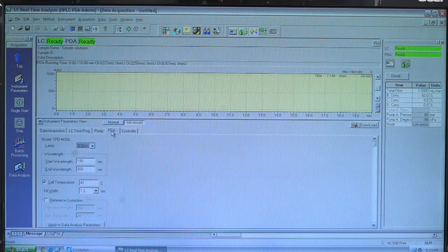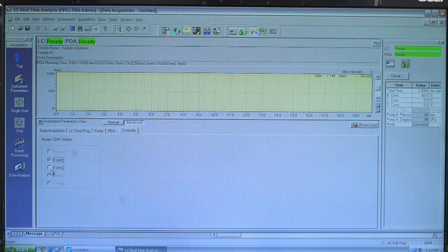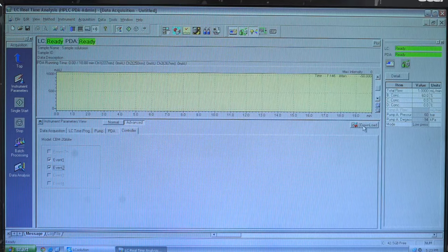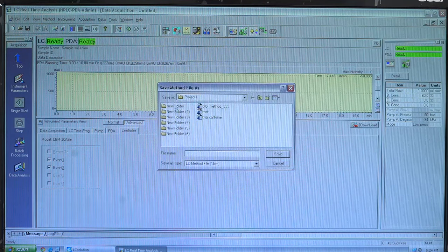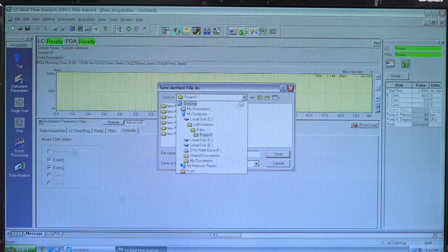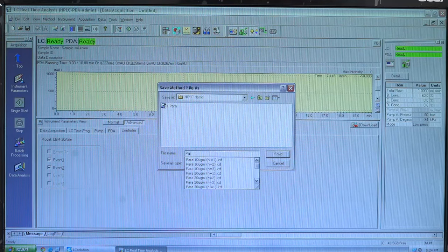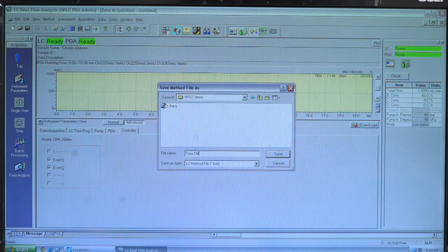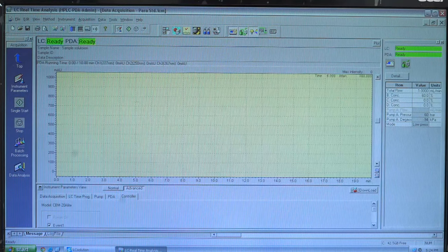We will then give input for the PDA detector, where we will select the D2 lamp for analysis. Finally, in the controller, we will tick Event 1 and Event 2 as we are using two channels. After completing the normal and advanced settings, we will download our method file. The system will ask for a path to save the file, and we will save the method file as 'para standard'.